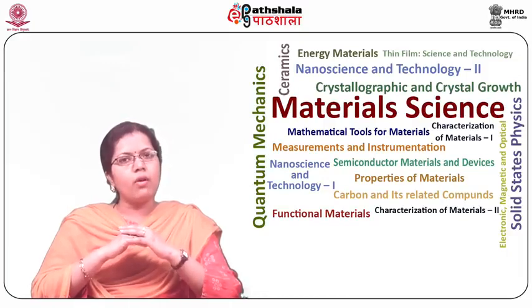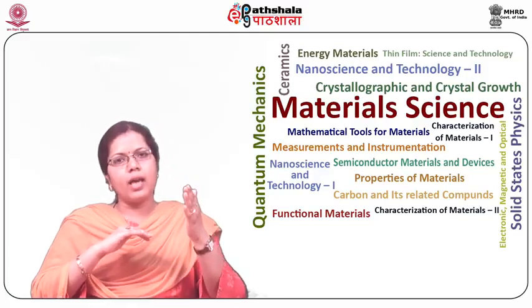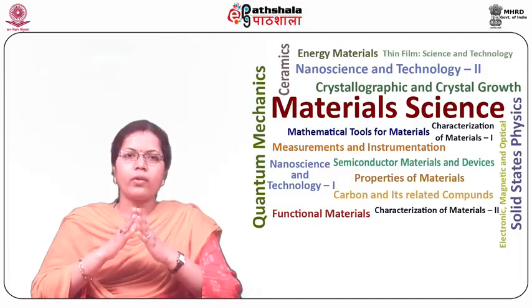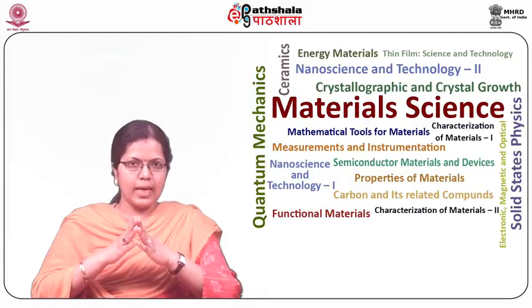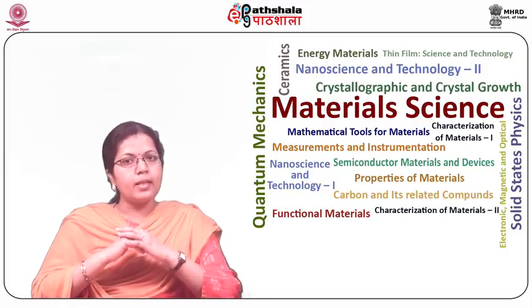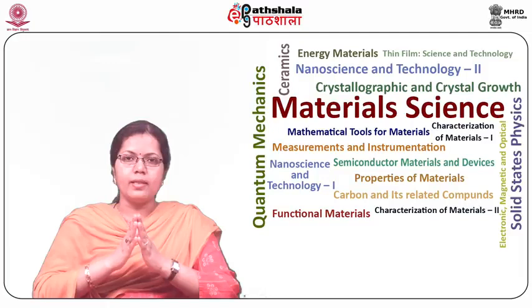However, the resolution of an optical microscope is limited by the wavelength of the light. This limitation was demonstrated by the microscopist Ernst Abbe in 1873. According to Ernst Abbe, the resolution of an optical microscope is limited to roughly half the wavelength of the light, that is about 0.2 micrometers in case of visible light. It means that it is easy to distinguish whole cells as well as organelles.